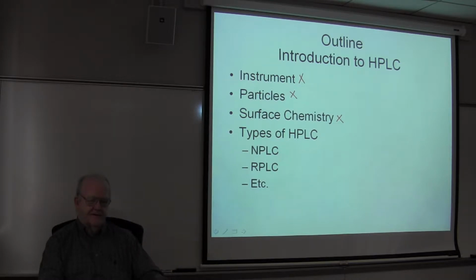The rest of HPLC is all sorts of things: alumina, synthetic organic polymers, biopolymers, all sorts of things. But the vast preponderance of HPLC work is done on silica and chemically modified silica surfaces. So we'll spend a good bit of time on that.